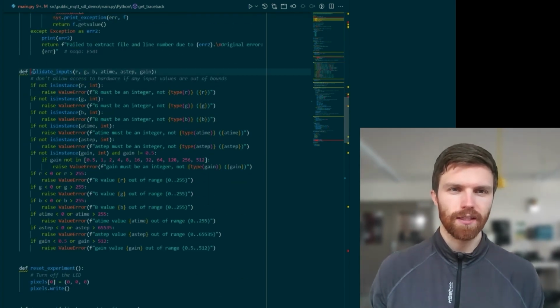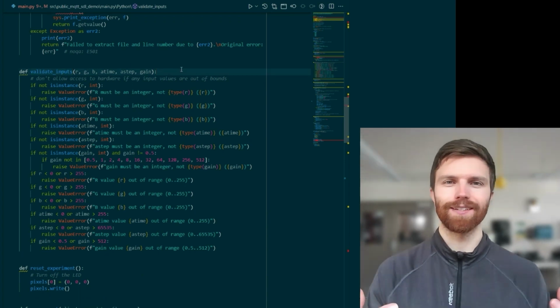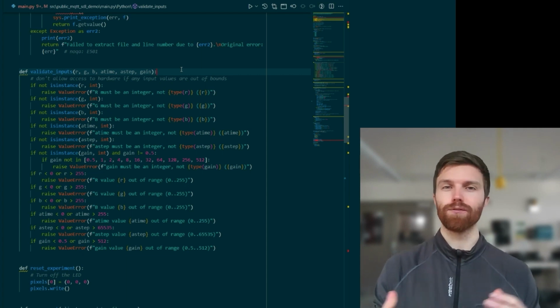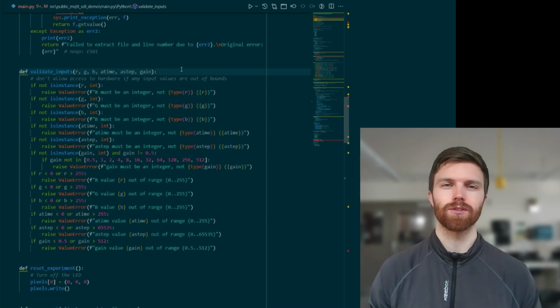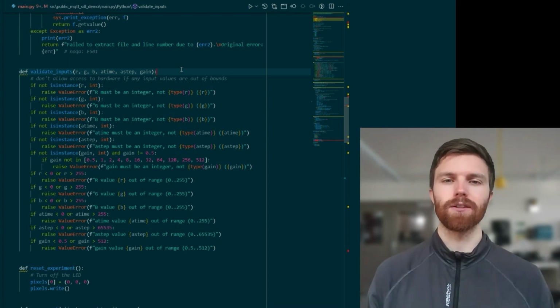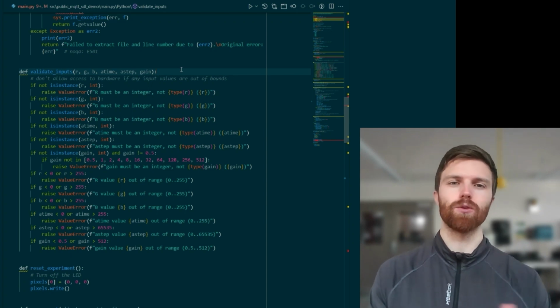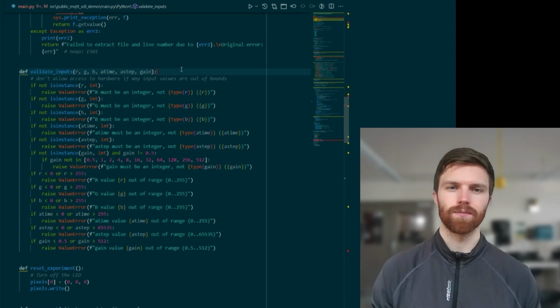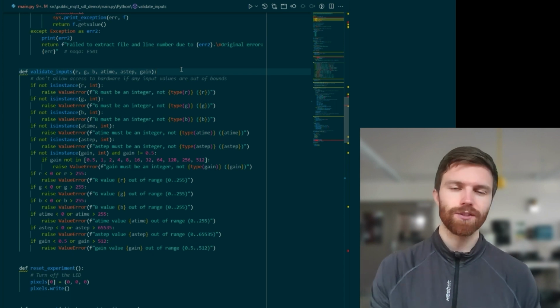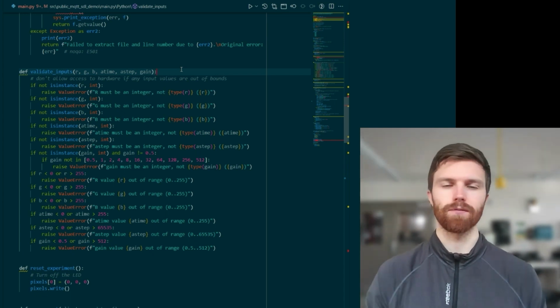We have a function for validating the inputs to make sure the inputs aren't violating something that could go wrong. This would be really useful in a case where you have moving components and you want to make sure to constrain whatever inputs are there to safe values. So let's say you have a robotic arm and you want to restrict the movement to certain levels or certain speeds, or you have a dispenser and you want to make sure that the dispenser isn't run on full power.